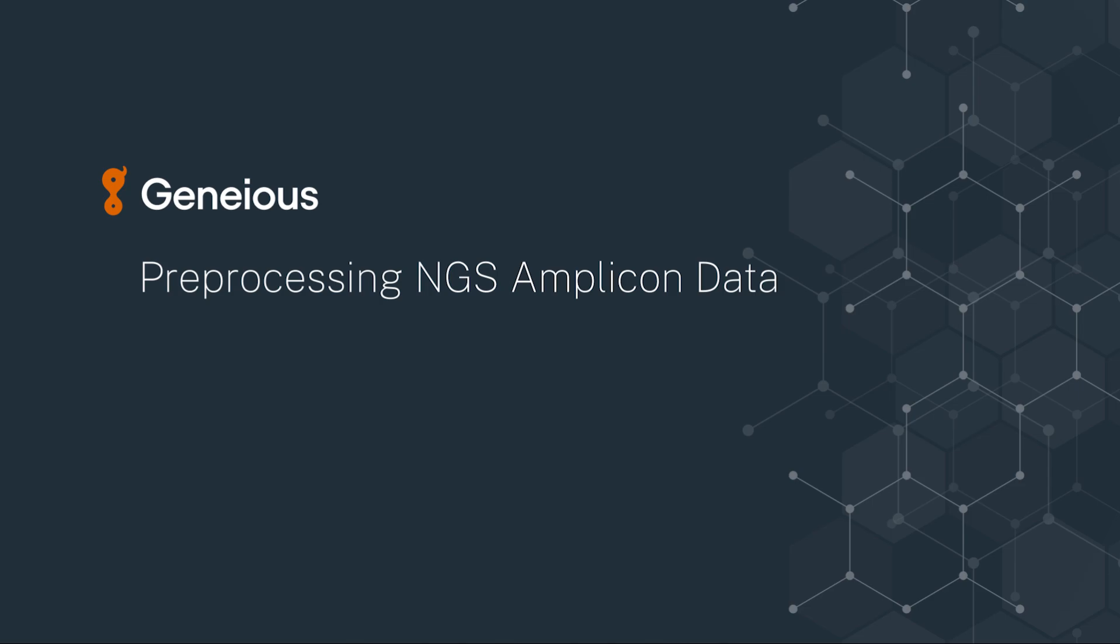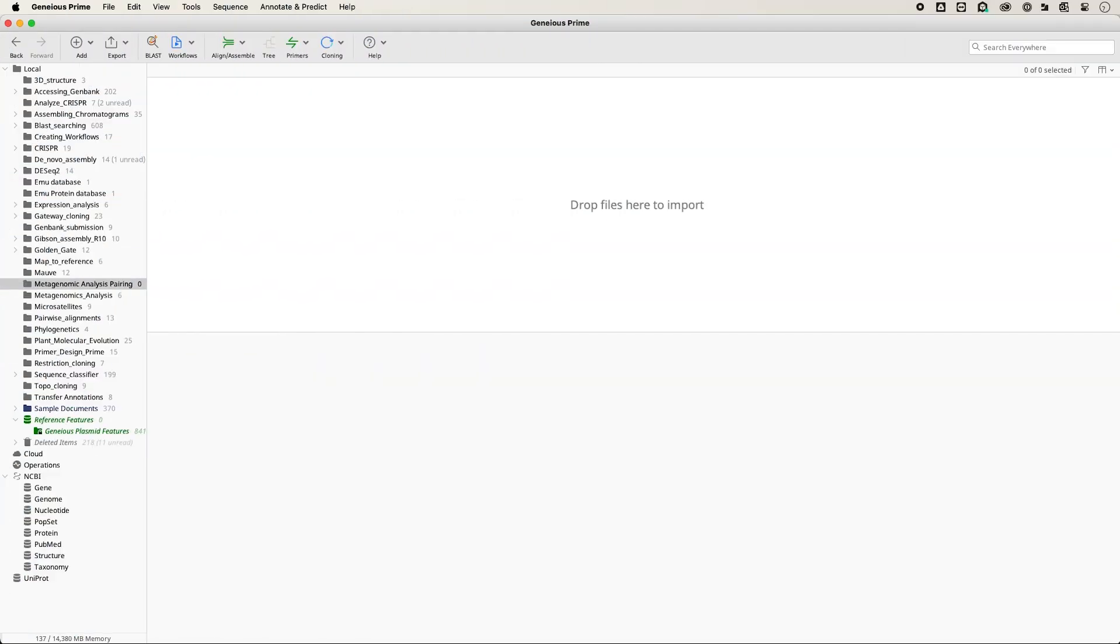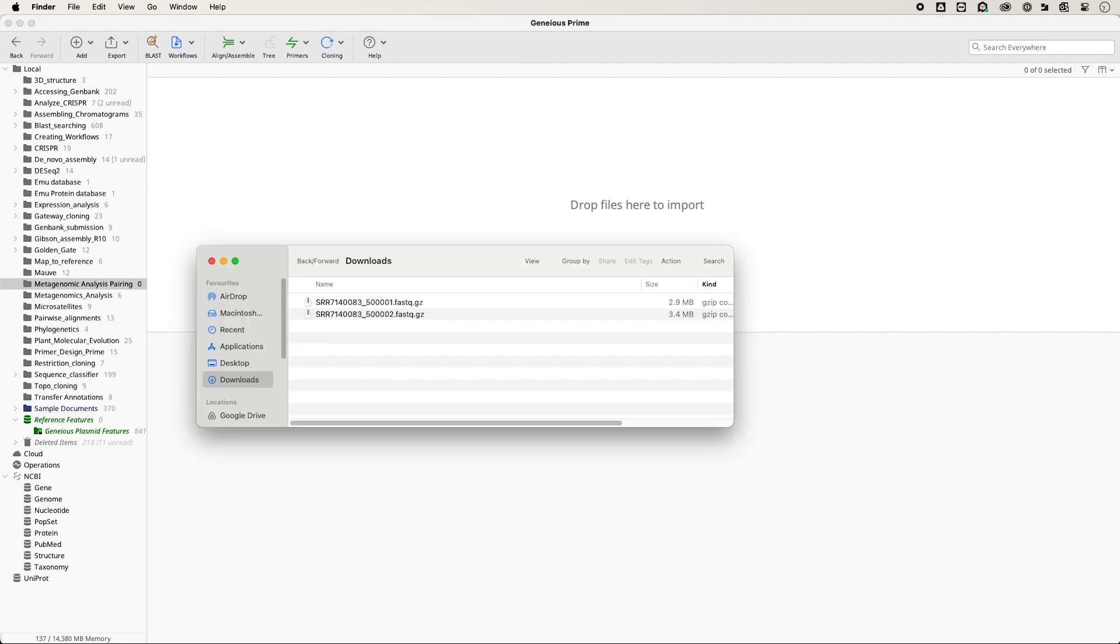Welcome to this video on pre-processing NGS Amplicon data by trimming and filtering sequences. To get started, open a file of reads.